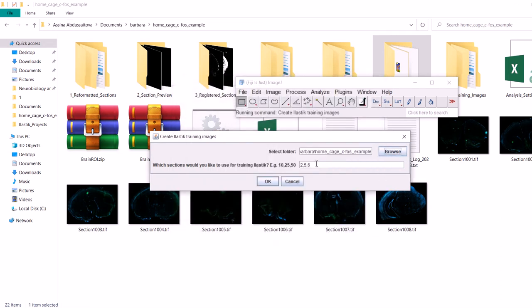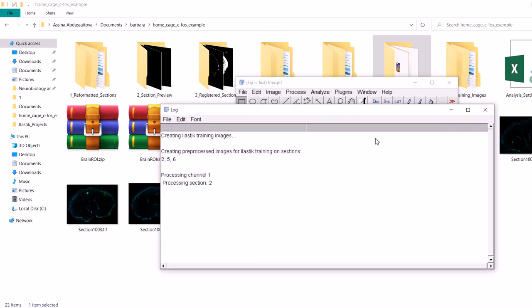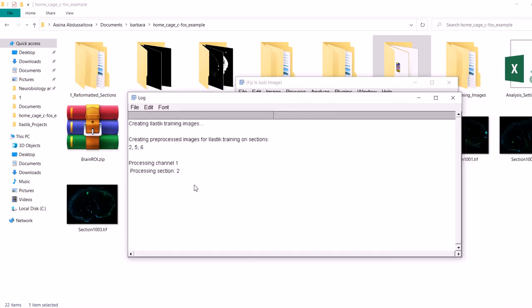Okay, then we select it, and now we can choose any number of your sections. We have only 8 here, so I will choose the same. I will choose 2nd, 5th, and 6th. Okay, so it's gonna be this one, this one, and this one. Okay, now we are ready. Click OK, and then the batch process will start. The log window will open, and you will see the logs, which section is processed right now.